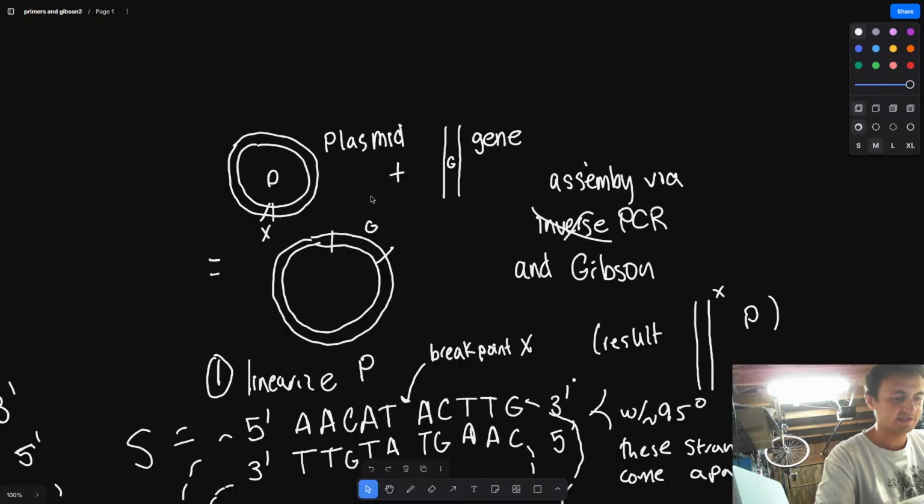Okay, now let's start small again. Step 2, amplify the gene. Insert.